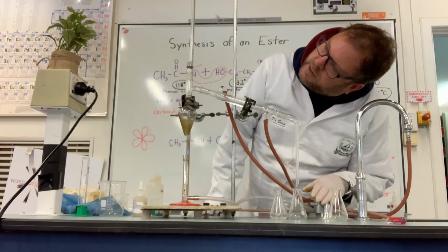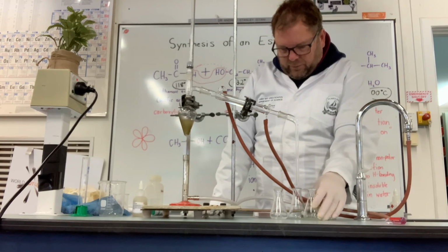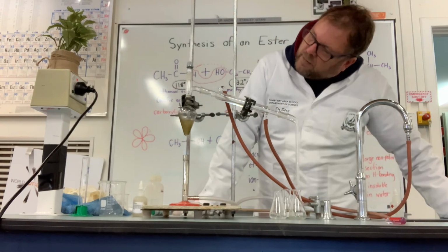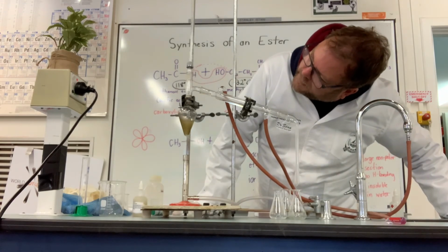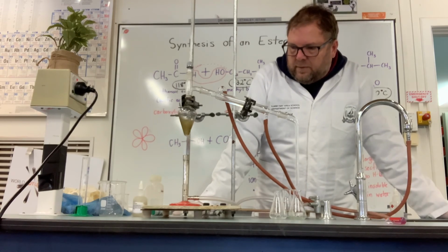Coming with a rush now, and that is up to 140. So what I'm going to do now is hopefully most of the unreacted alcohol has come across, so I'm going to switch my flask again, and hopefully this flask here should be collecting most of the alcohol that's coming across.